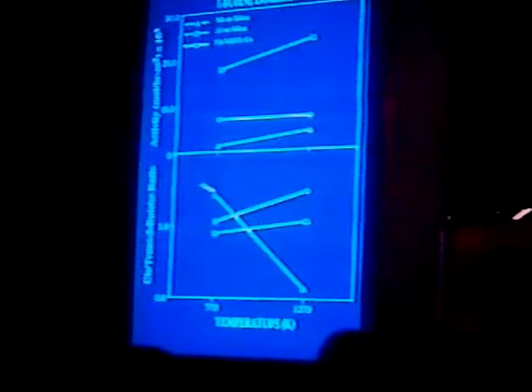If we look at the bottom line, which is the selectivity shown as the cis-to-trans butene ratio, then if we have niobium alone, after calcination we saw a significant decrease in the selectivity, which again is not picked up in the surface mixed oxide. These results taken collectively suggest that the niobium is not free to do whatever it does on silica alone, and we can draw from that that we are building a niobium-alumina interaction sitting on the silica substrate.